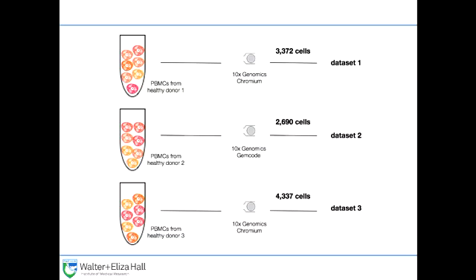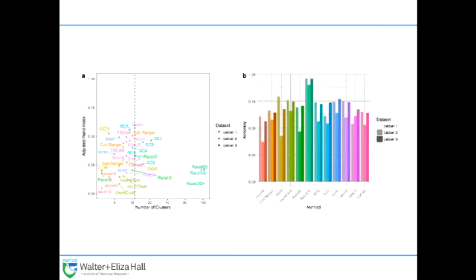We can do another approach, with 10x data here, PBMCs. We can take biological expert annotations for these cells, for these 3 data sets, so a reasonable idea of ground truth. Here you can immediately see that all of the methods have much, much lower adjusted Rand index values, essentially telling us that this is a much harder clustering problem than that first one of the 3 separate cell types.